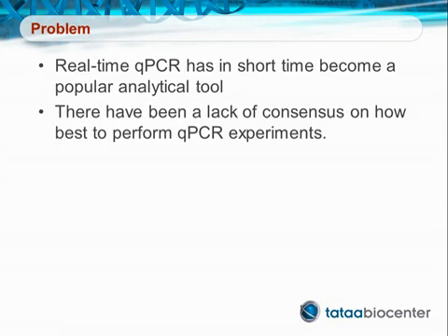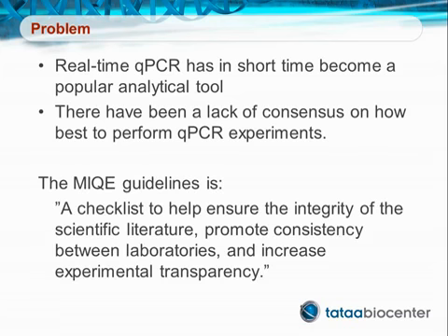And why is that necessary? Well, real-time qPCR has in a short time become a popular analytical tool, and there has been a lack of consensus on how best to perform qPCR experiments. So, the MIQE guidelines are a checklist to help ensure the integrity of the scientific literature, promote consistency between laboratories, and increase experimental transparency.